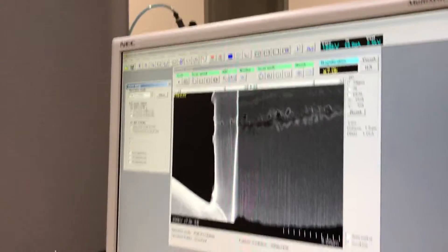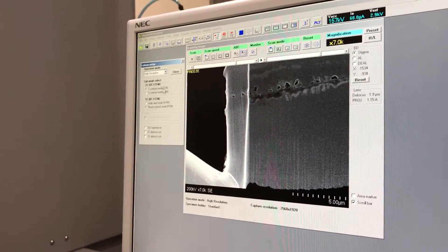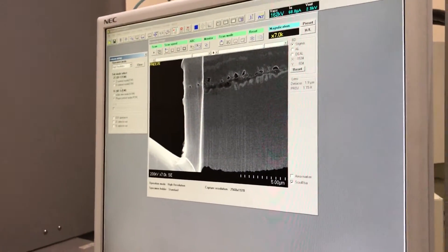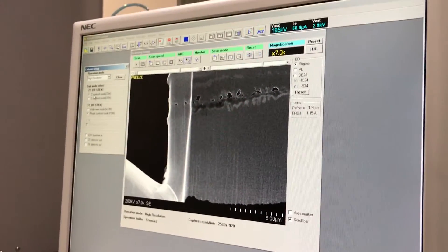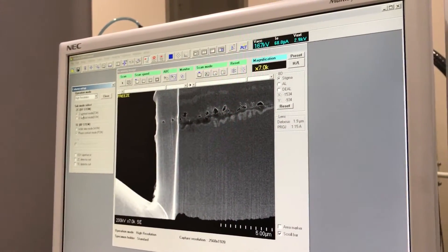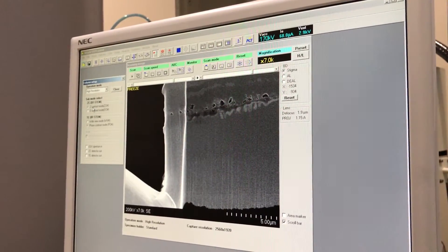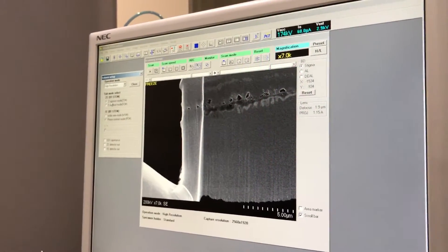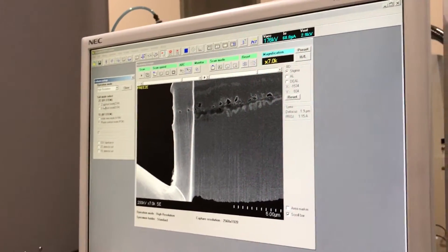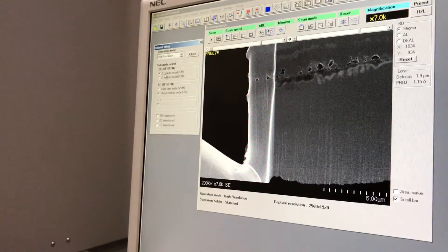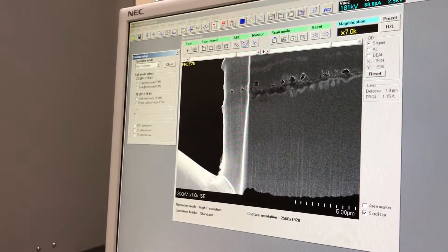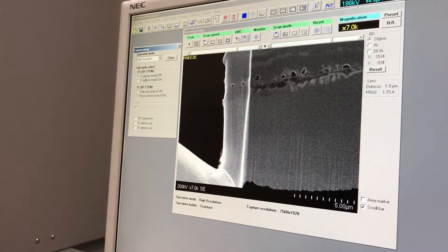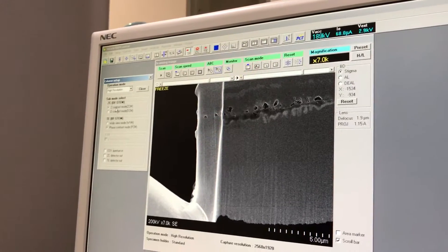So let's choose high resolution from here. There are two sub-modes you can select: Z-contrast or D-contrast. Z-contrast is basically the same as backscatter on SEM imaging. So if you have a coating on your sample, different compositions, or any contamination inside your sample, and there is a difference in density or atomic number, you will see a different contrast when using Z-contrast mode.